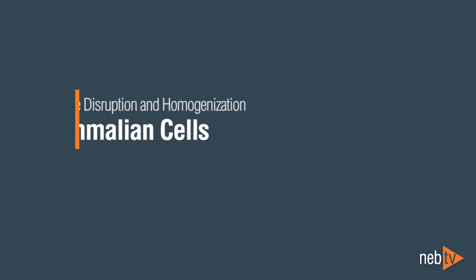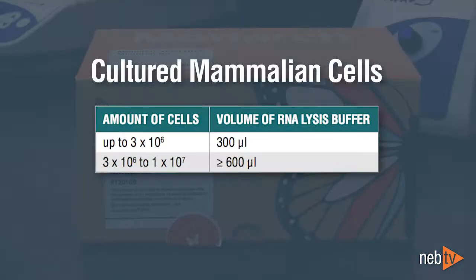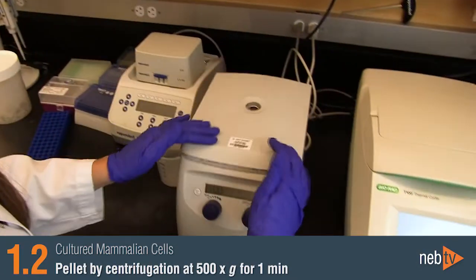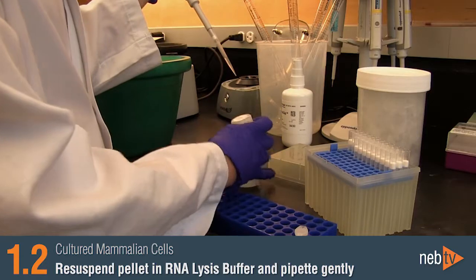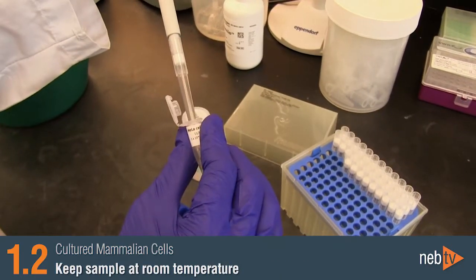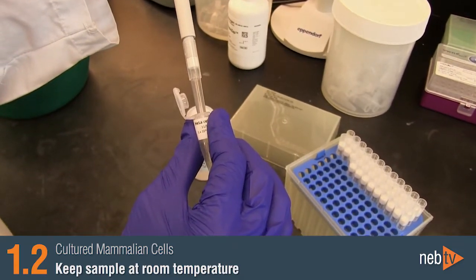Part 1: Sample Disruption and Homogenization for Cultured Mammalian Cells. Mammalian cells, either in suspension or pellets, are readily lysed in RNA lysis buffer without the need to add Proteinase-K. First, pellet cells by centrifugation at 500 times G for one minute. Starting with the cell pellet, resuspend it in the appropriate amount of RNA lysis buffer by pipetting gently to prevent foaming. Keep the sample at room temperature instead of on ice, to ensure that the detergent in the buffer does not precipitate.